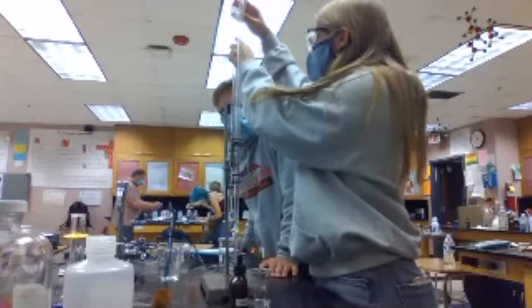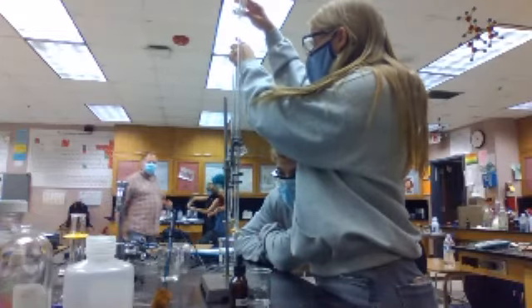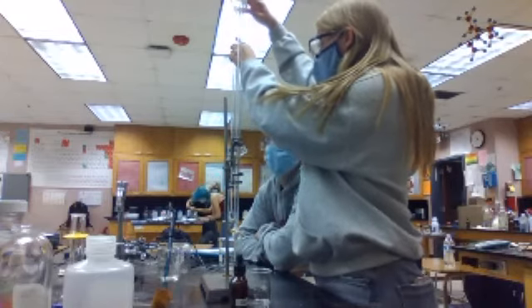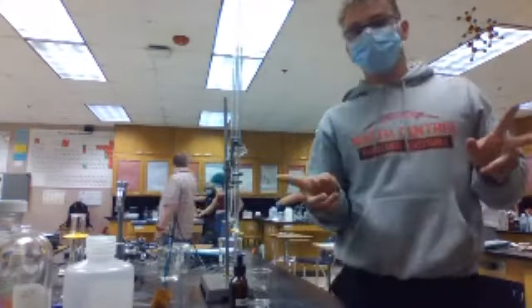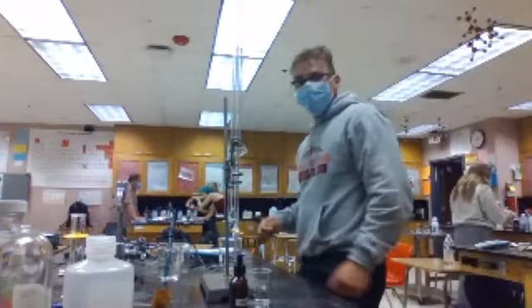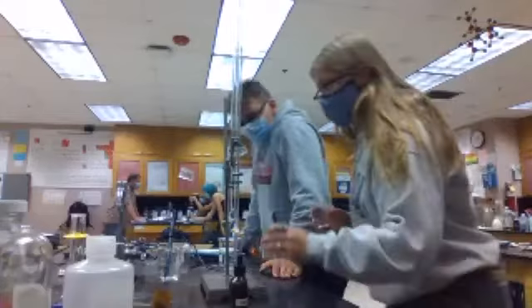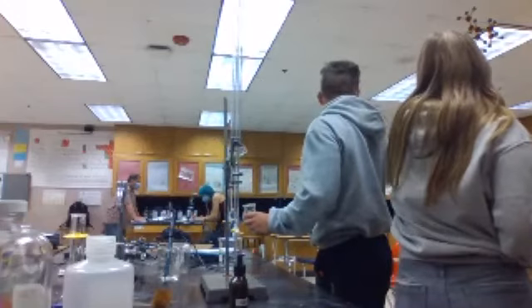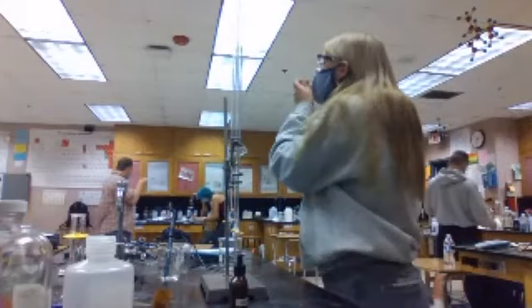Hold on. 40. I don't want to fill this up again. The phenolphthalein is going to change colors. Put that in. So it's going to change to whatever color. You need to get more of this base and be really careful when you touch it. It's the really long bottle. And don't get a lot of it. Get less than 10 milliliters.